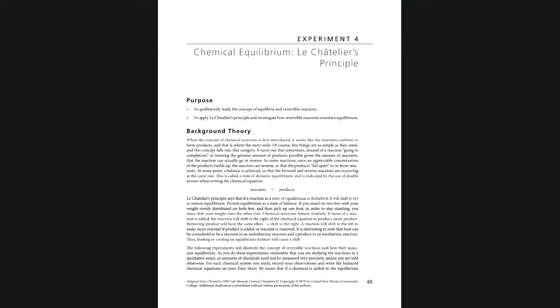Based on Le Chatelier's principle, if you have a system at equilibrium and you apply any pressure to this system, the reaction is going to shift. The direction can shift from the reactant side to product or product to reactant, depending on what you have added or what has happened to the reaction mixture.